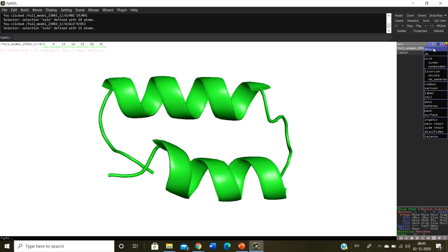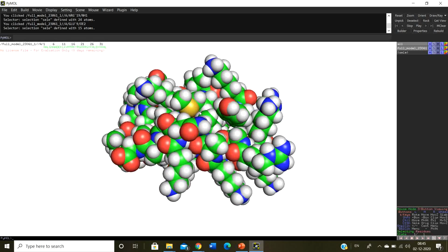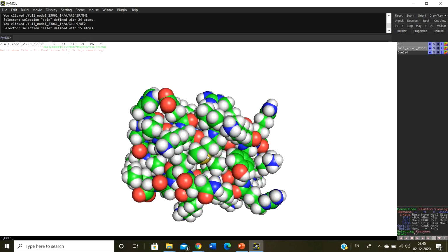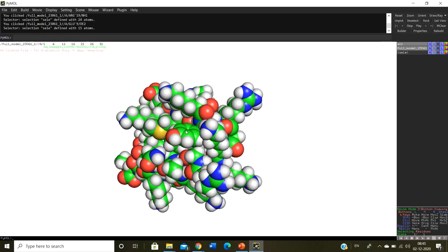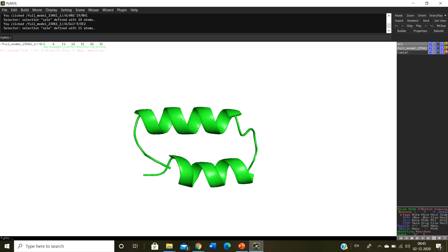Now in the show option, we are also going to have some other options, like there is an option called sphere. Okay, if you click on it, it's going to make you a ball of spheres. Okay, so why is it important? But can you understand anything from the sphere? No, you are unable to see anything for sphere, because the sphere is not meant for everything.